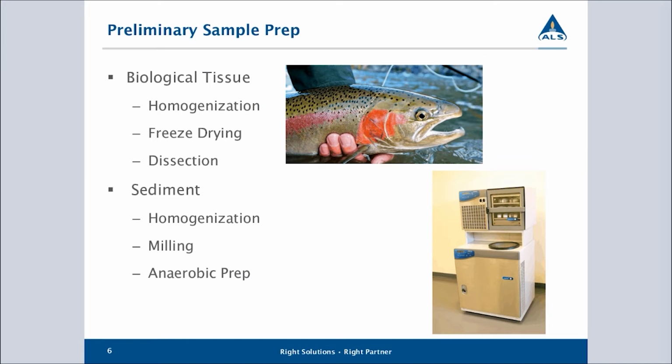Sample prep, it's all in the details. In regards to sample prep, the importance and absolute necessity of thorough homogenization in any matrices you're dealing with is recognized by our lab as being an integral part of our standard operating procedures.